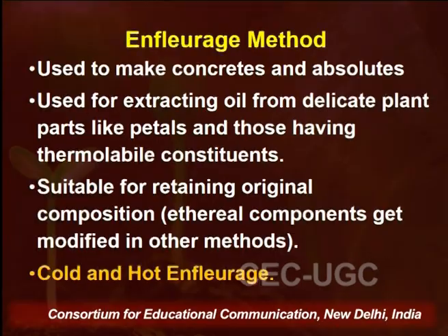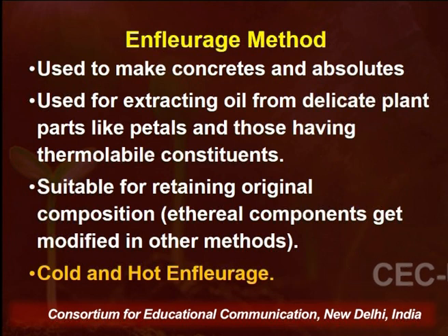Now we move on to another traditional technique, that is the enfleurage method, and this technique is largely used to make concretes and absolutes. Concretes are the extracts of the plant material that contains volatile oil, and those extracts are prepared with the help of non-aqueous solvents. Whereas absolutes are the concentrates, or pomades, extracted with ethanol, and the ethanol is distilled off. The remaining product is called an absolute.